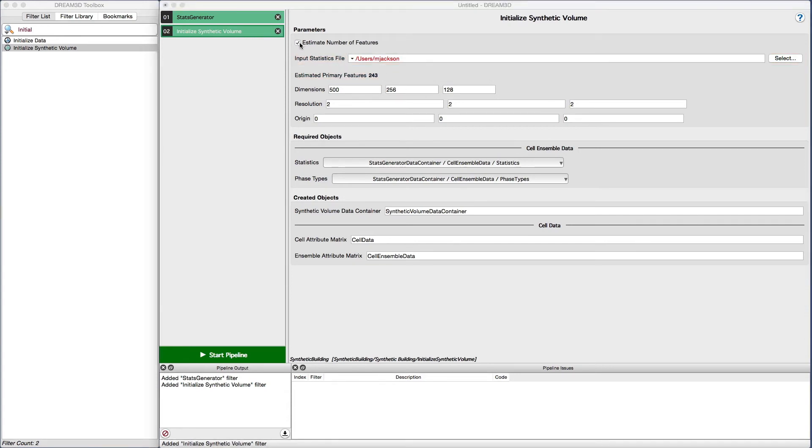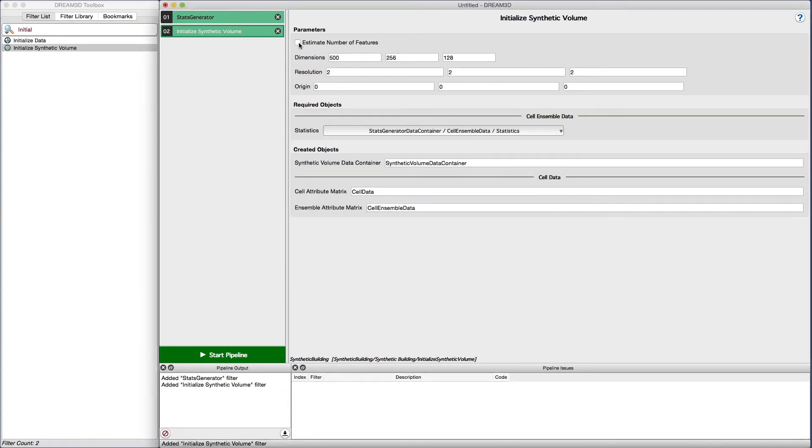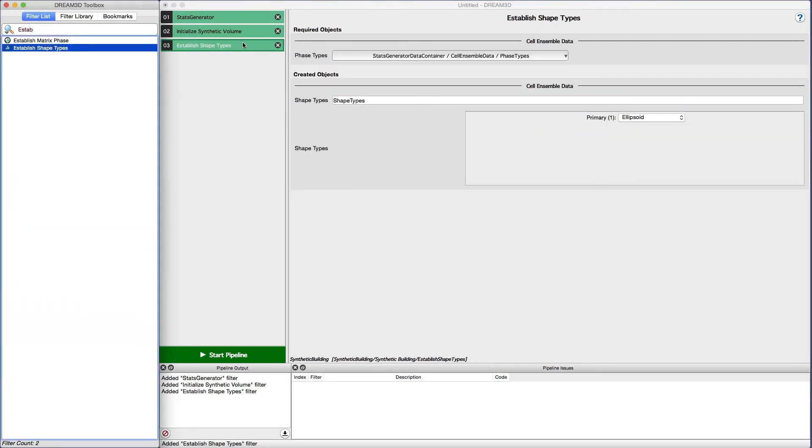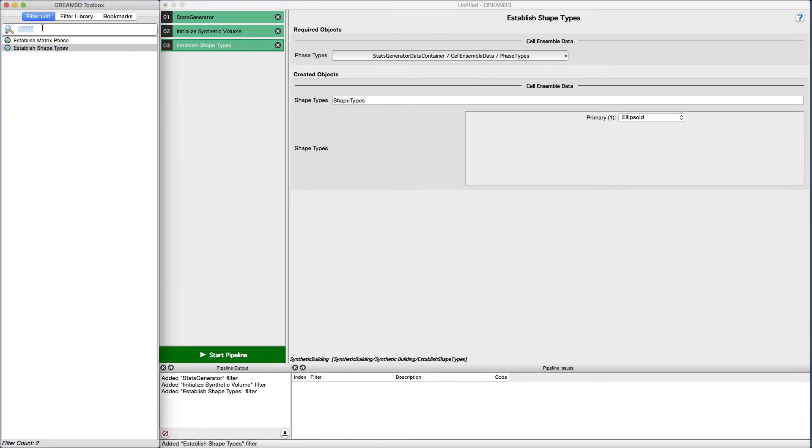Next we add the establish shape types filter and select ellipsoids as the general shapes for our grains. After that, we will add the pack primary phases filter. We are going to just accept all the default values.